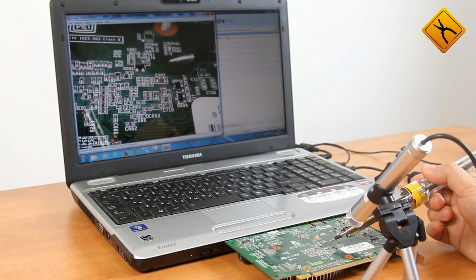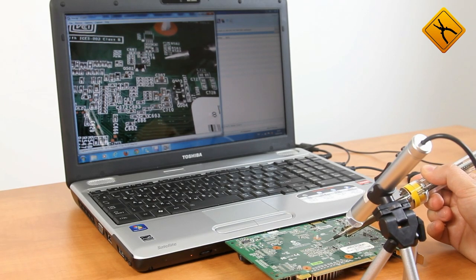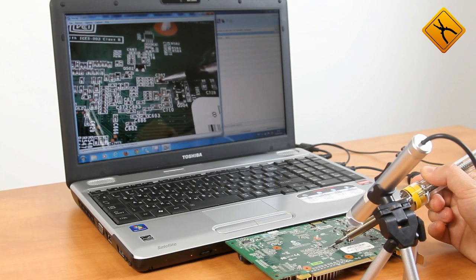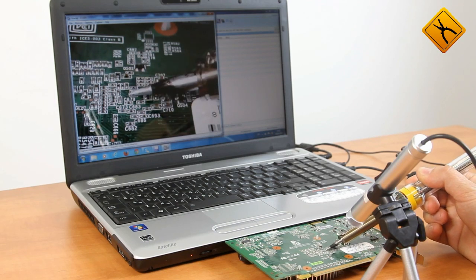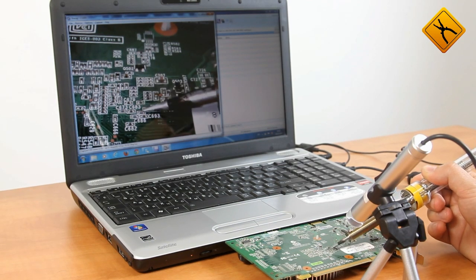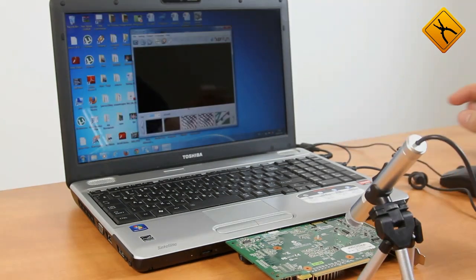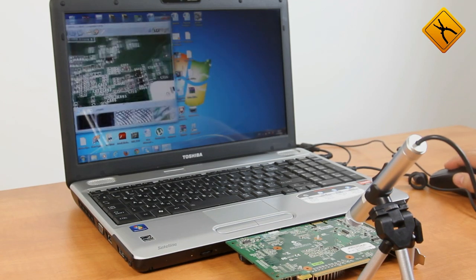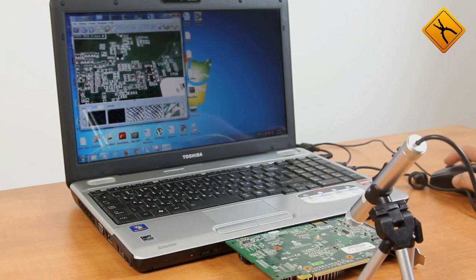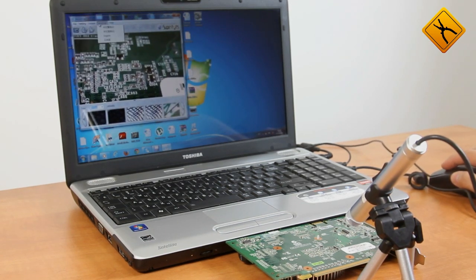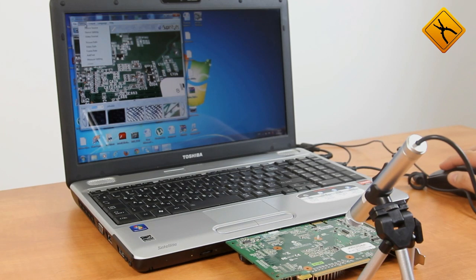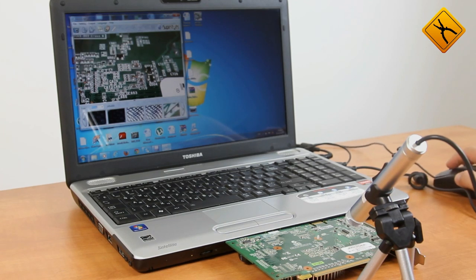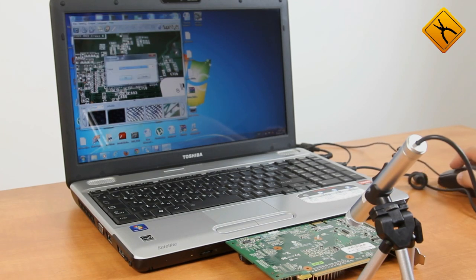For static objects or photos, 2 megapixel mode or 1600x1200 dots is optimal. In this case, it is advised to use the default SuperEyes software. It allows taking pictures using either the microscope button or the software button. Let's run the program and set a maximum resolution.